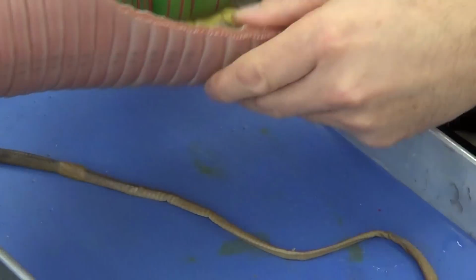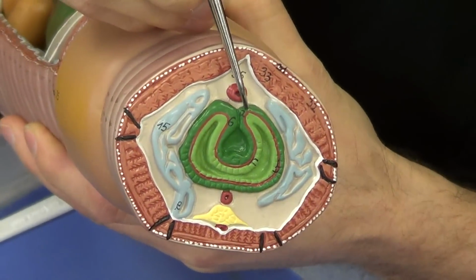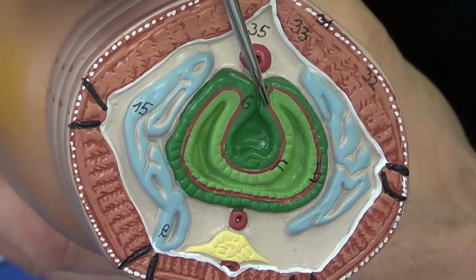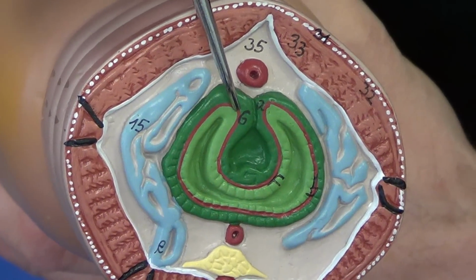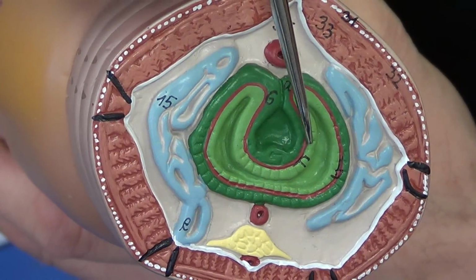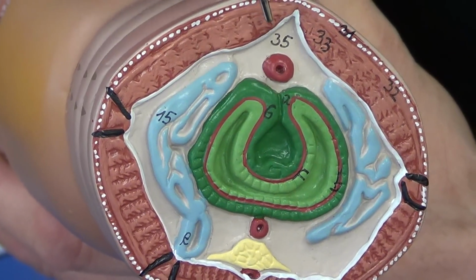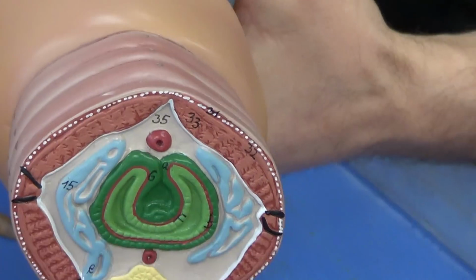And number two, if we look at a cross section of the intestine, you'll see that right here we have an infolding of the intestine, and it forms a loop. And this loop is going to greatly increase the surface area in the intestine. You can see that if the tissue just came straight across, we would lose all that additional surface area for absorption. So this structure has a name. It's called the typhlosole, and its job is to increase the surface area for absorption.